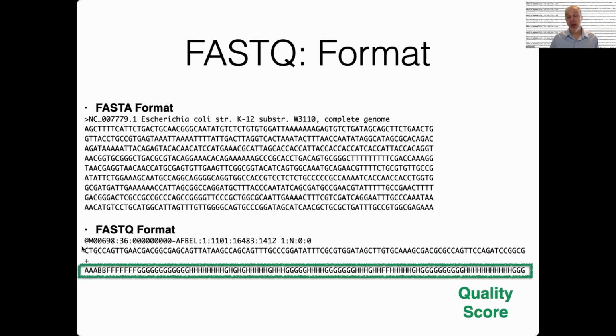In the real organism, it could actually be a different base. And so this A here is telling us how reliable it is, how much we should trust this C. There's an algorithm for going from these quality scores that are characters into a number.